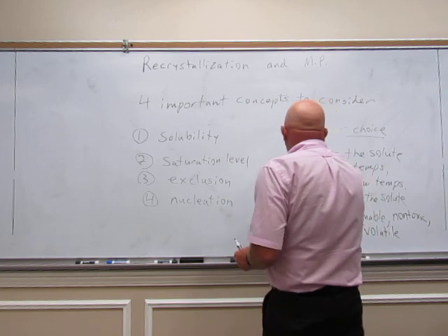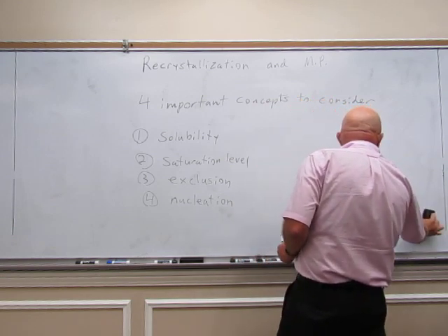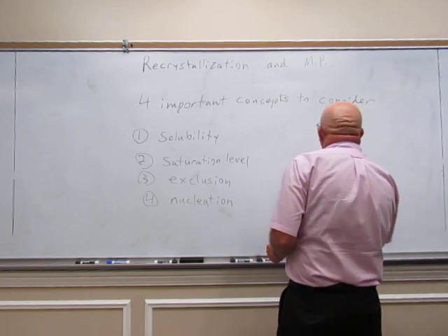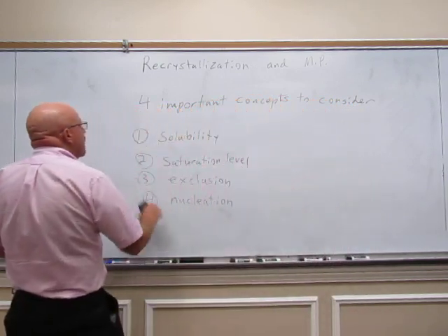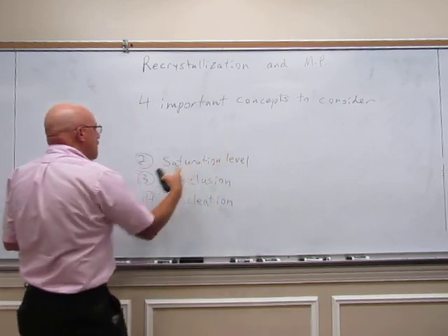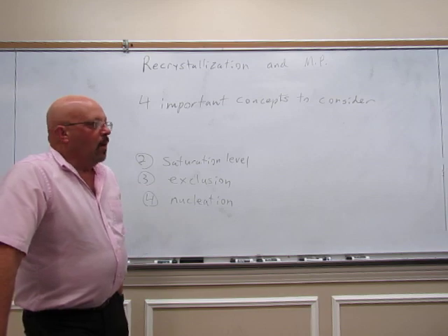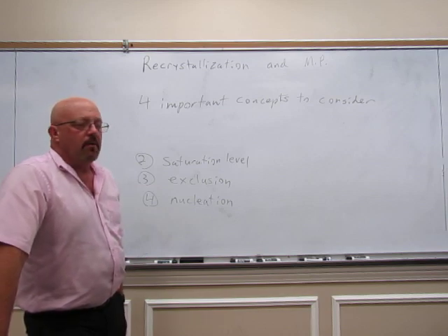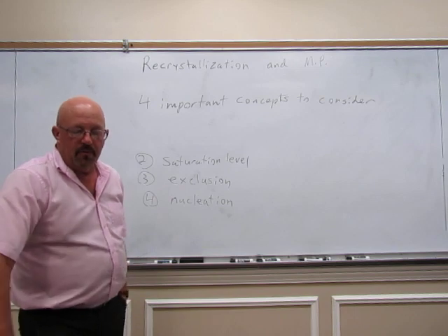Let's talk about the saturation level. We've already done solubility, so let's talk about saturation level. When we are recrystallizing, it's important to use a minimal amount of solvent.